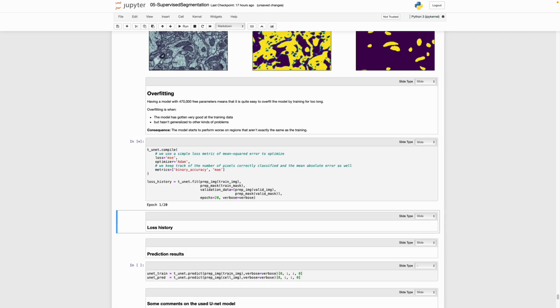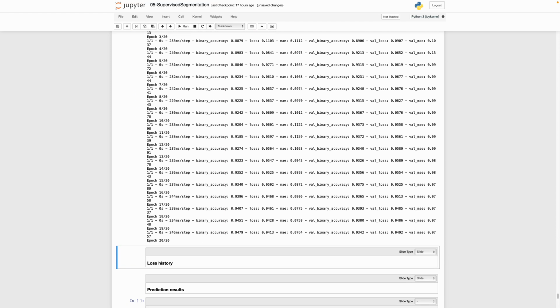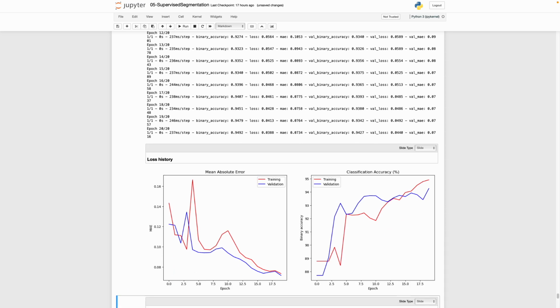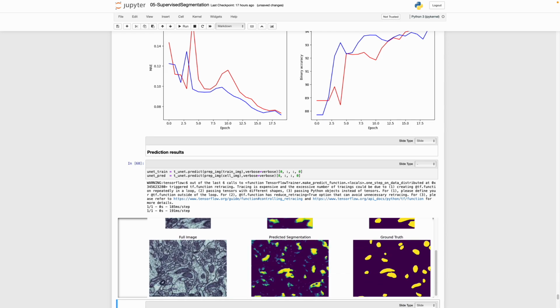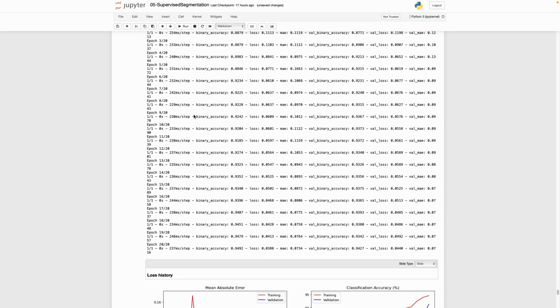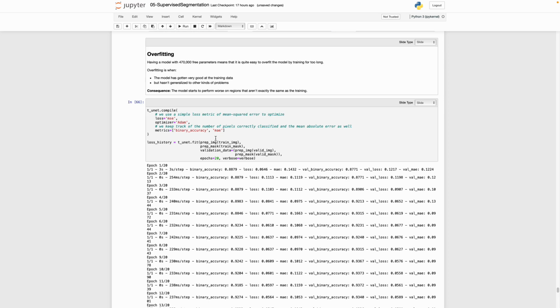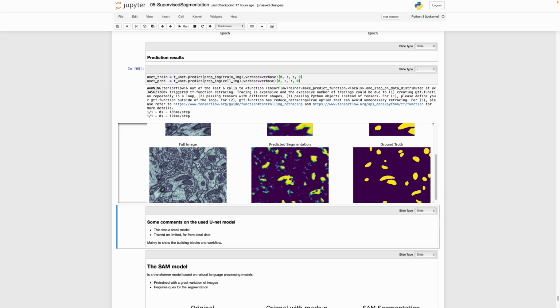So, and then we can try something else. And looking at the loss history of that, it's doing something. Let's see. Yeah, and now after that modification we did here, I think I changed some of the parameters, what kind of loss function I used, and that made the difference here now. And with that, we now start getting the mitochondria and less of the other things.